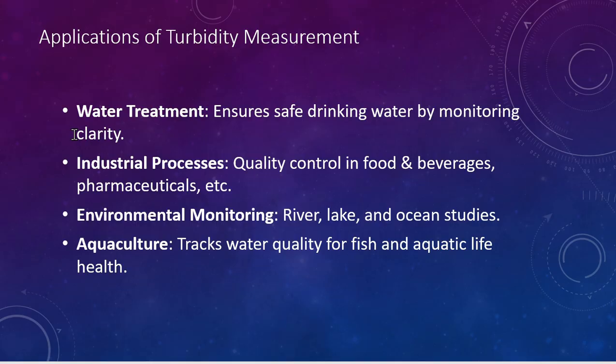Now let's see the applications of turbidity measurements. It is used in water treatment, to ensure safe drinking water by monitoring turbidity. It is used in industrial processes for quality control in food and beverage and pharmaceutical industries, etc. It is also used for environmental monitoring, like measuring the turbidity of lake water or river water. Also it is used in aquaculture, which tracks the water quality for fish and aquatic life health.